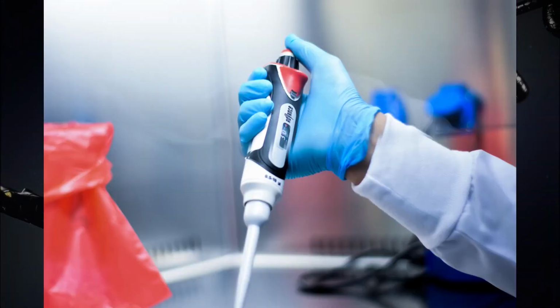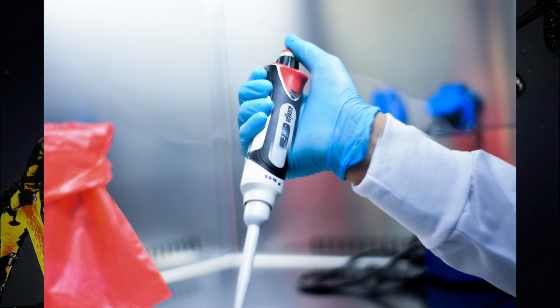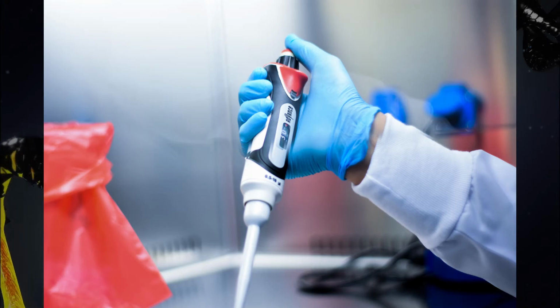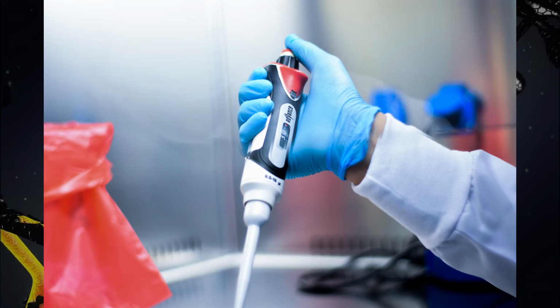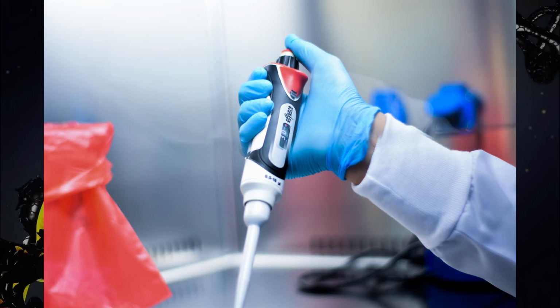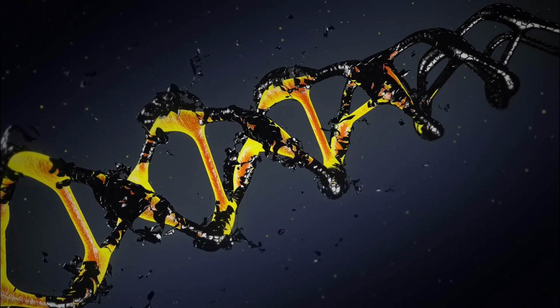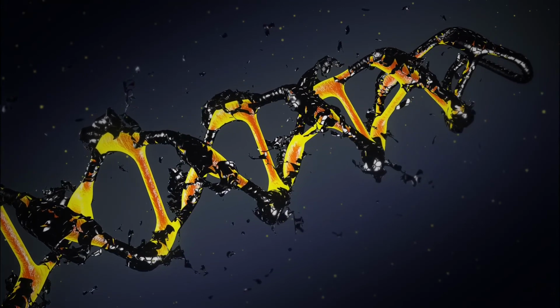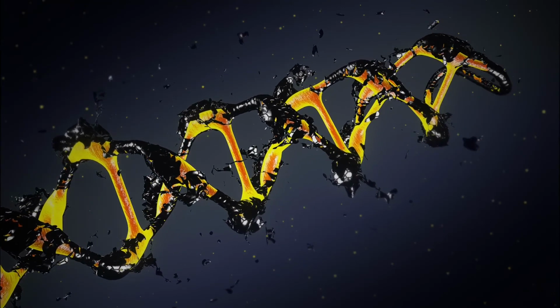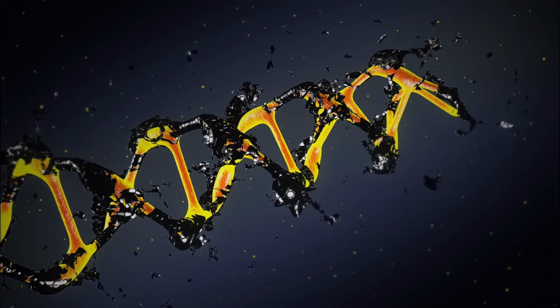This means you have absolute control over when certain things occur, such as inhibition of polymerases. This means that you can make sure that the proliferation of the DNA strand and how many times it's copied, when it's copied, and what occurs is under absolute control by the machine. This greater degree of fine control is what lets it specifically bind the primers to the right DNA sequences at the right temperatures, and then to denature them. This gives a very, very specific result.